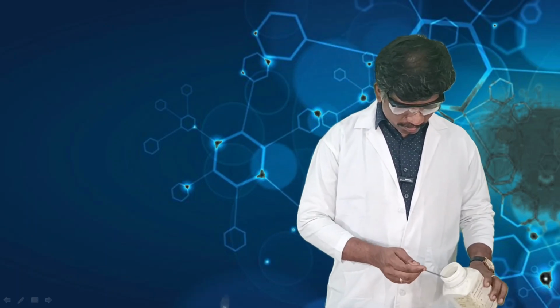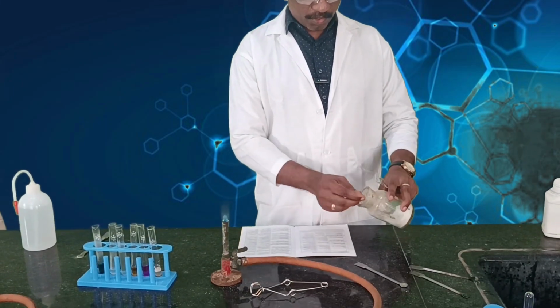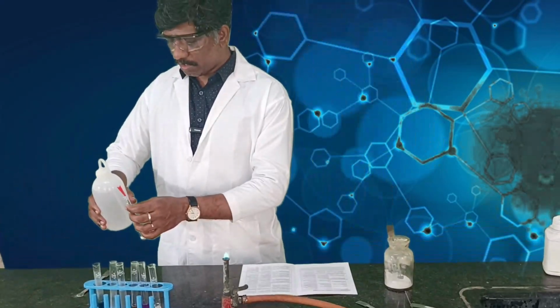Now we shall see how we test the presence of acid as a preliminary test. The first test we are going to perform is action of sodium bicarbonate. The sodium bicarbonate test is one of the tests to confirm the presence of acid. Take the sodium bicarbonate in a test tube and dissolve it in water.